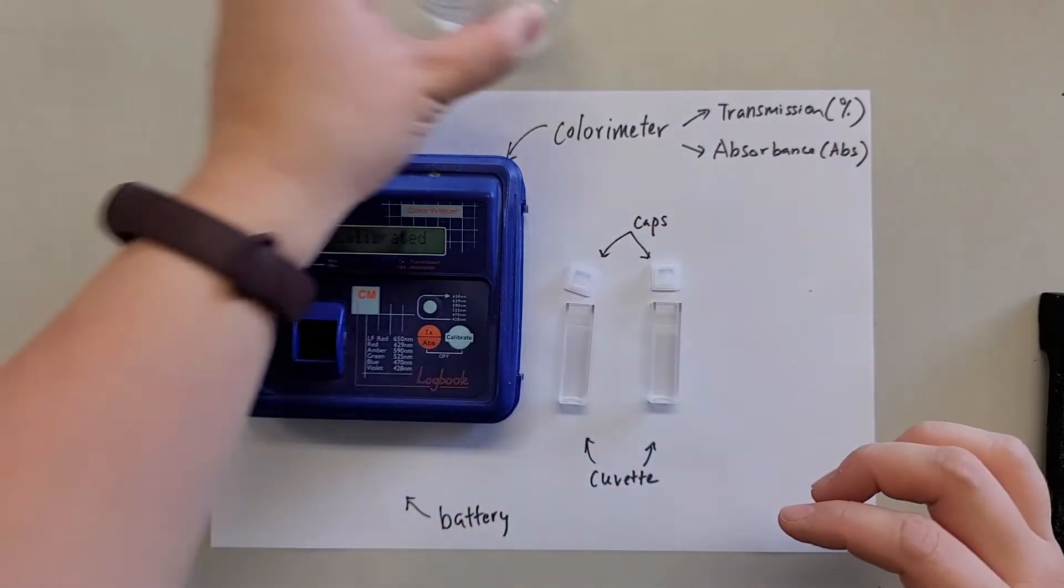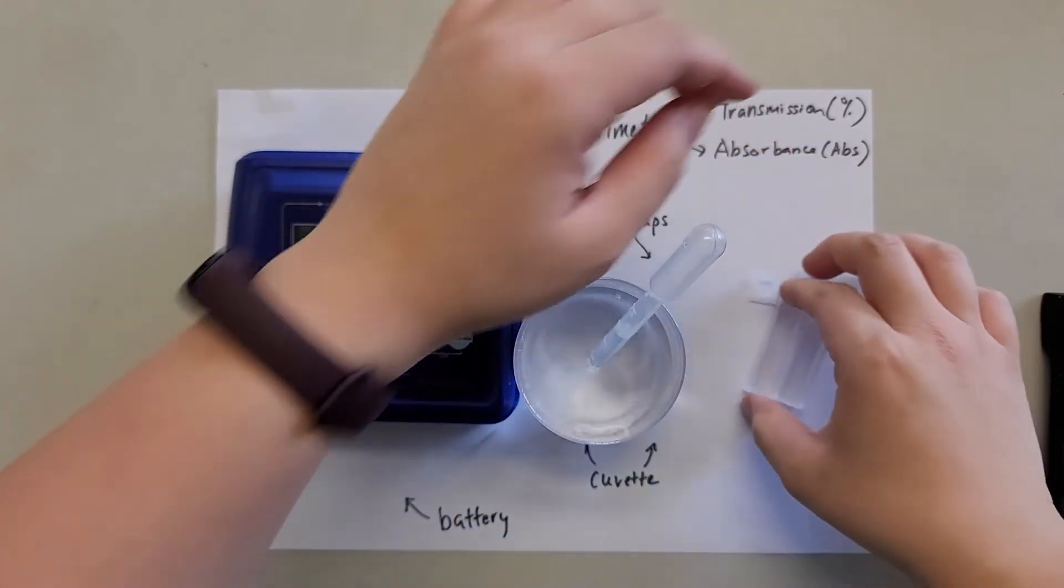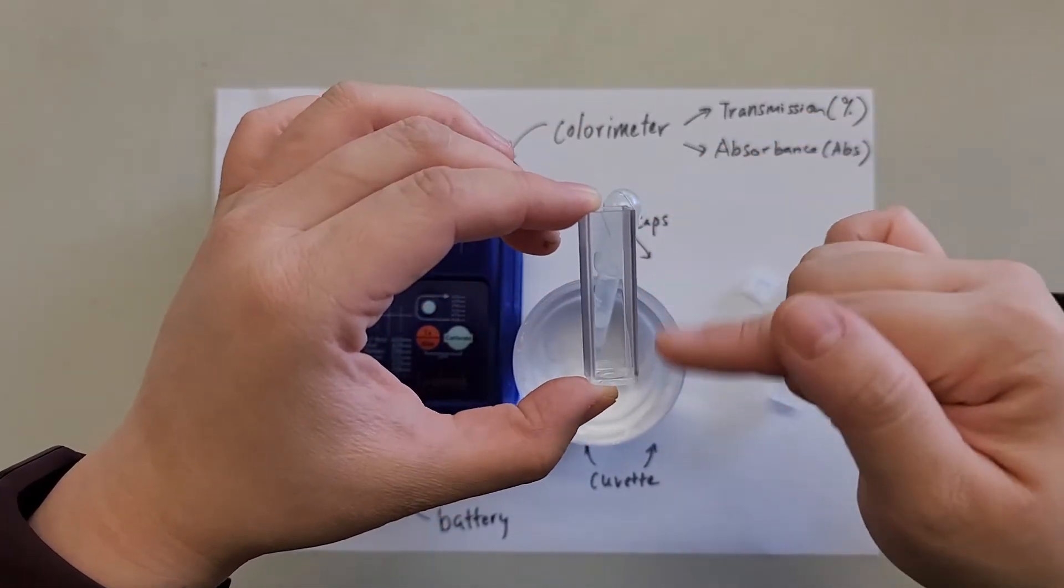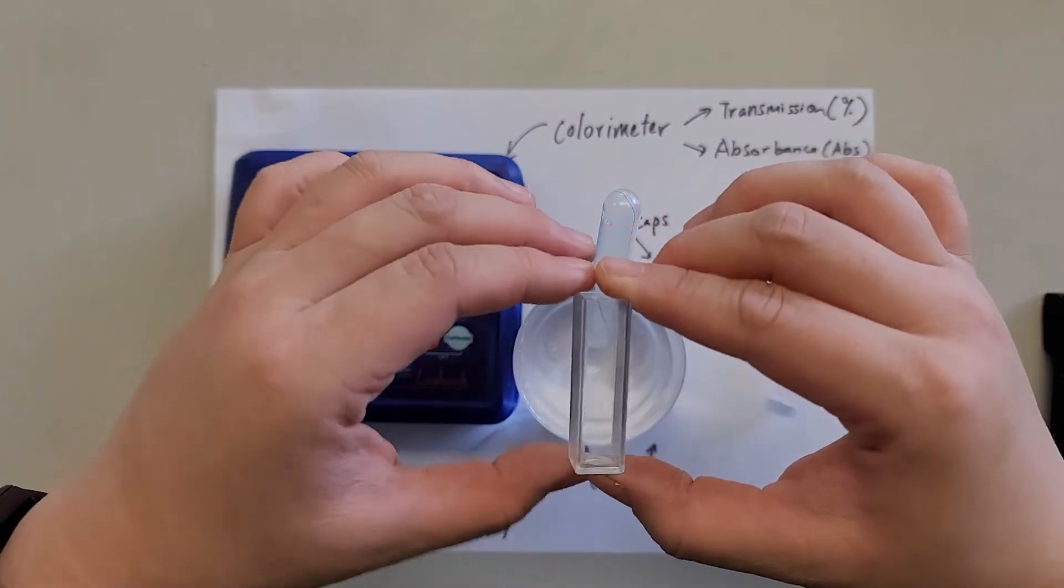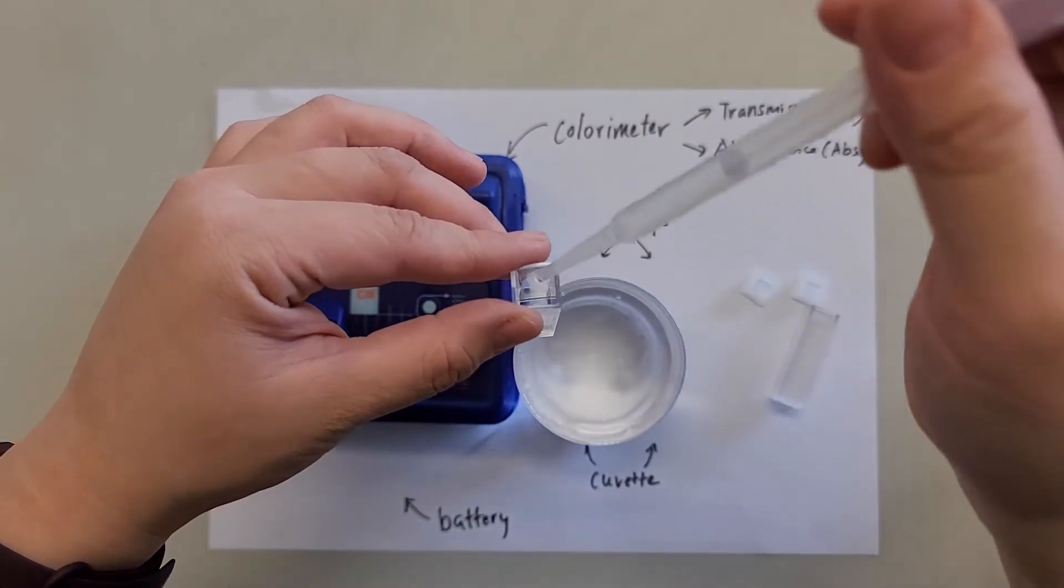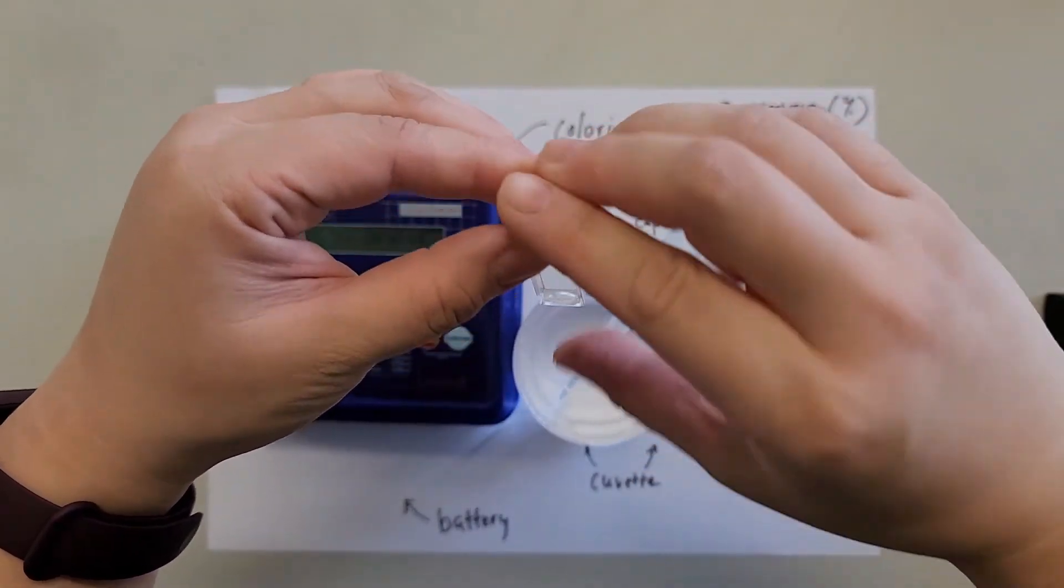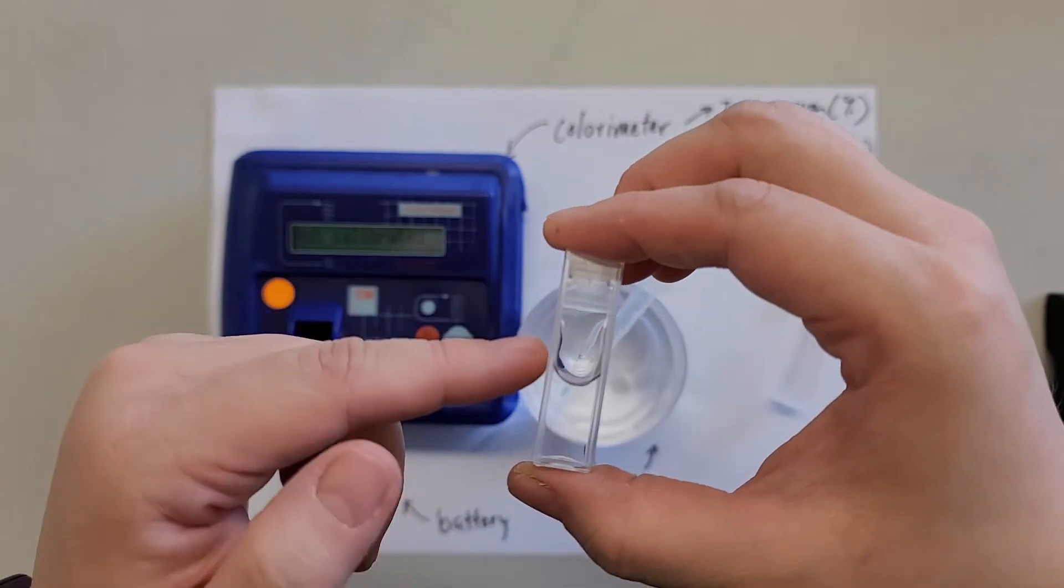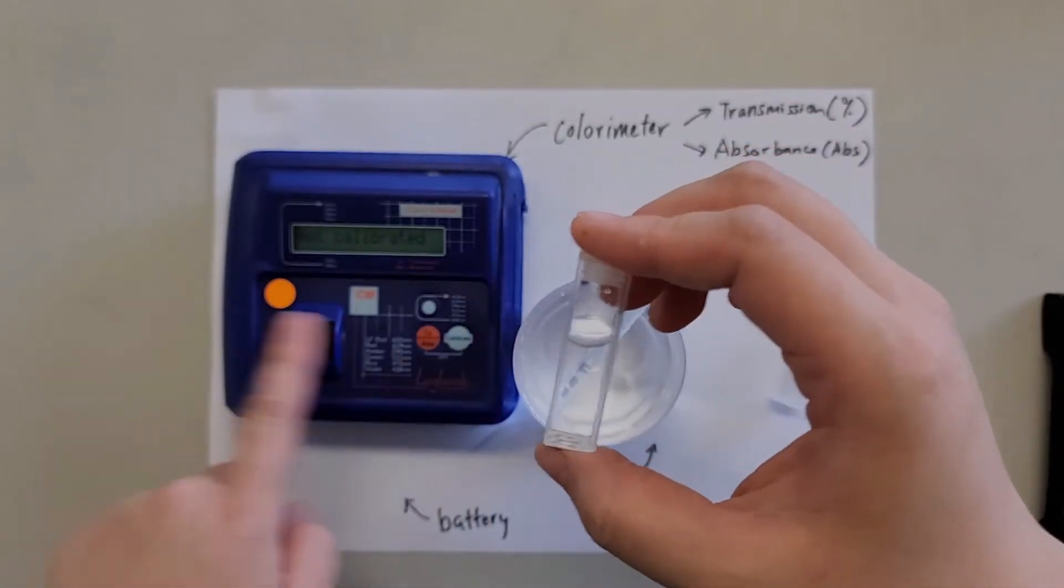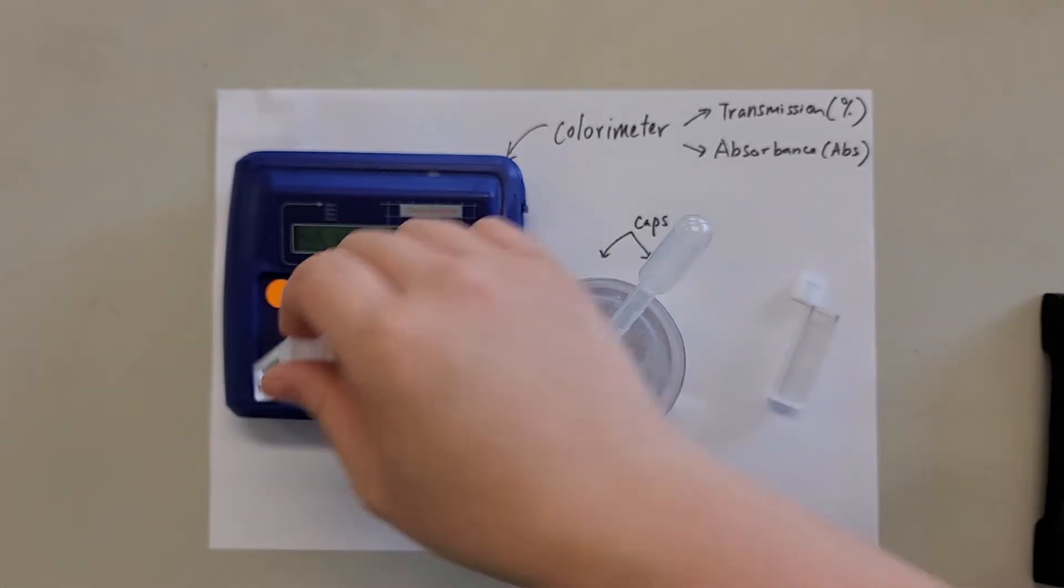We'll have some distilled water here. And then we'll fill it in. Now try to avoid touching the clear region because that's where the light will pass through. About three mils. And then you close it with the cap. Now this side is the clear side and this one is the cloudy side. Make sure the clear side is in the pathway of the light. The light is actually shining sideways.